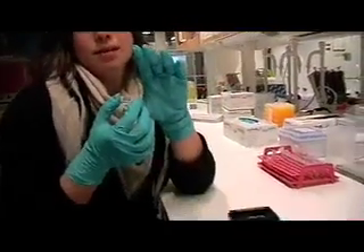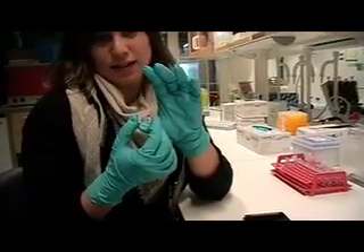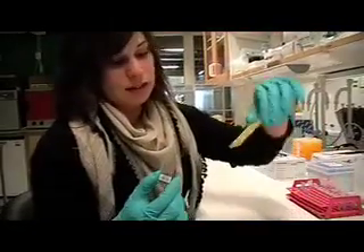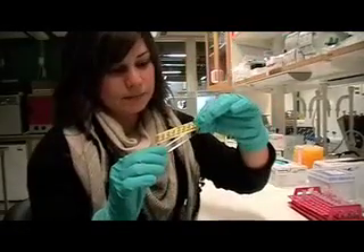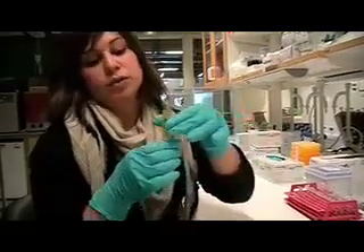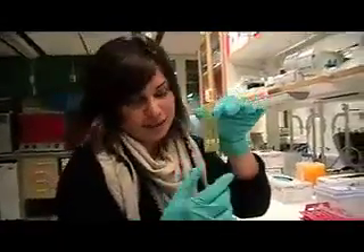We test the presence or absence of proteins using antibodies. Since we have 14 blocks on the slide, we use this mask to create 14 different wells. You can put 14 different antibodies or 7 antibodies in duplicate.